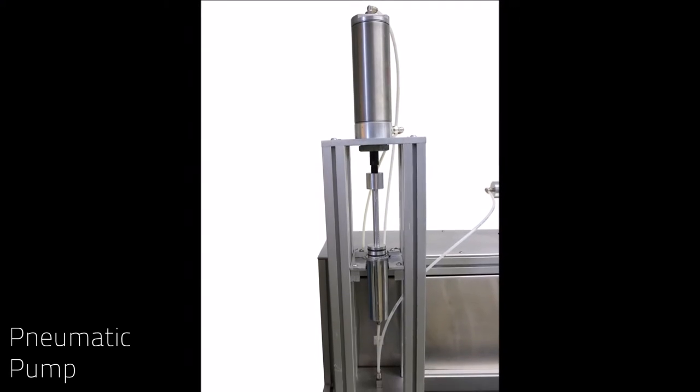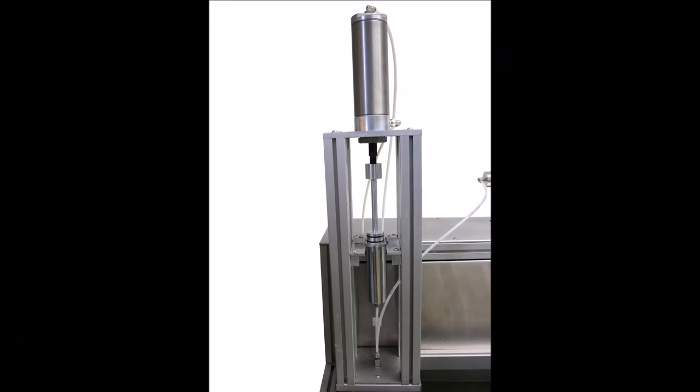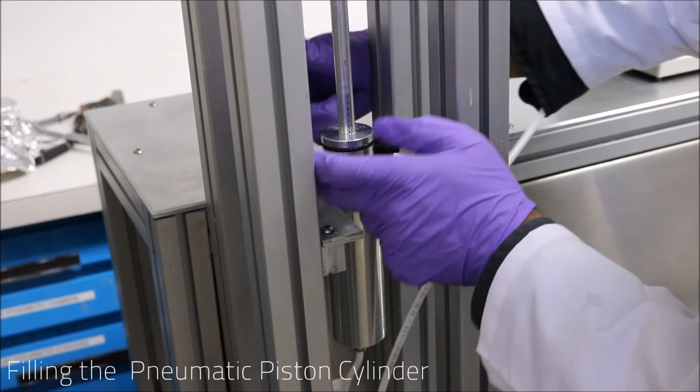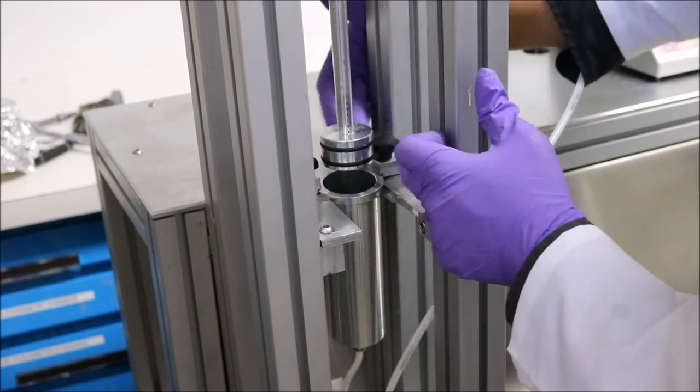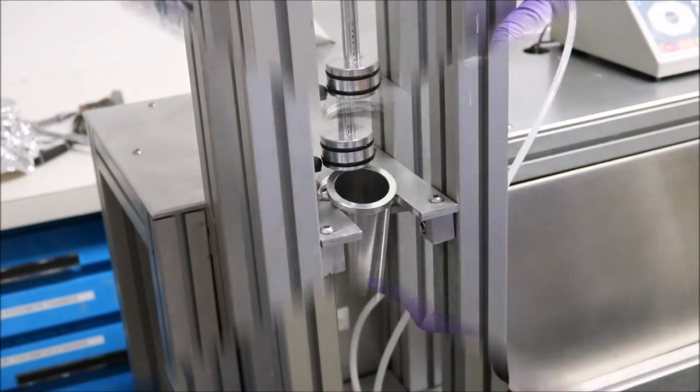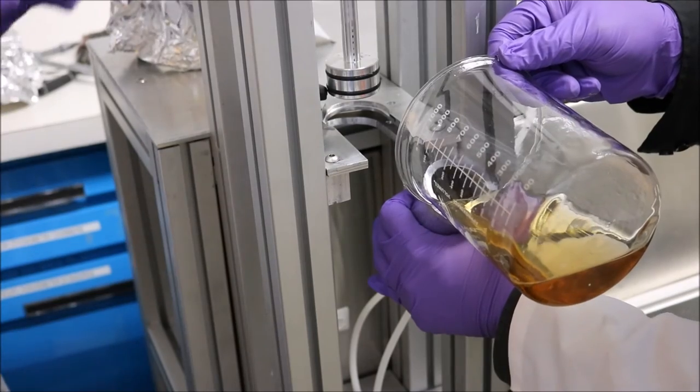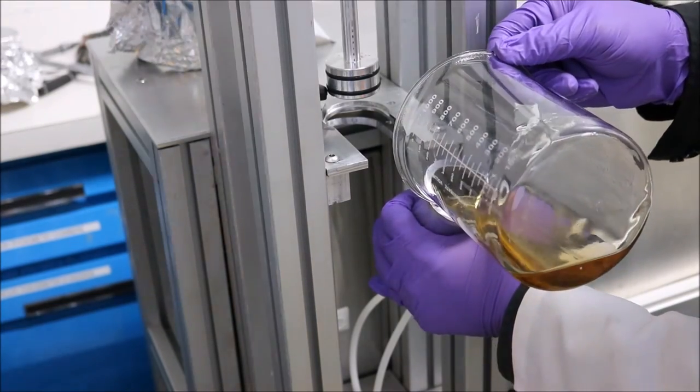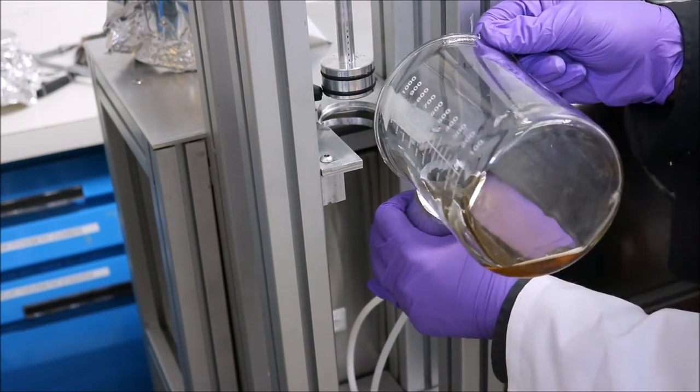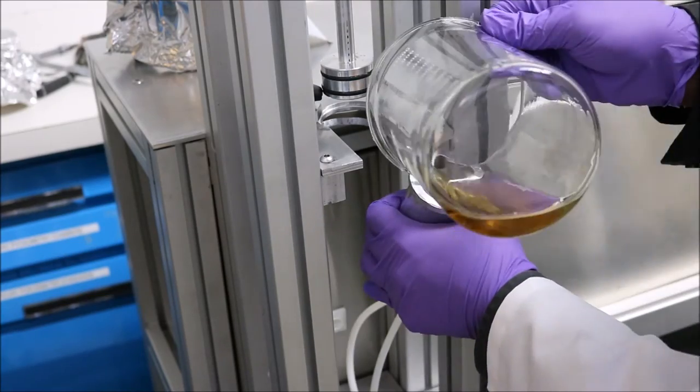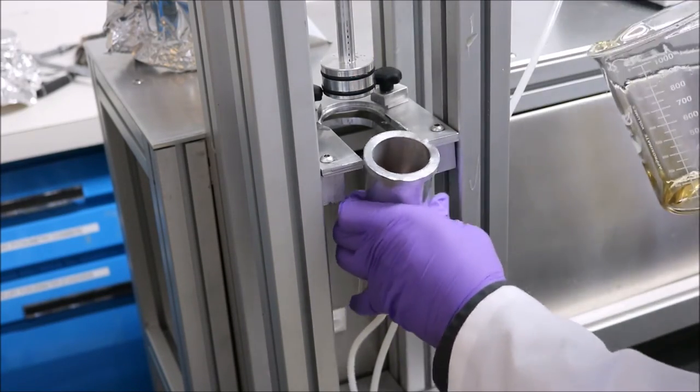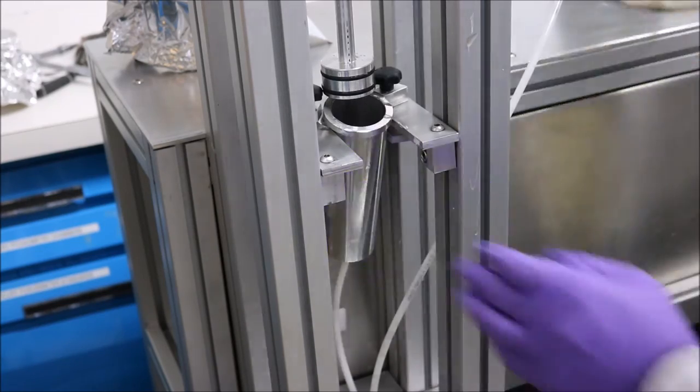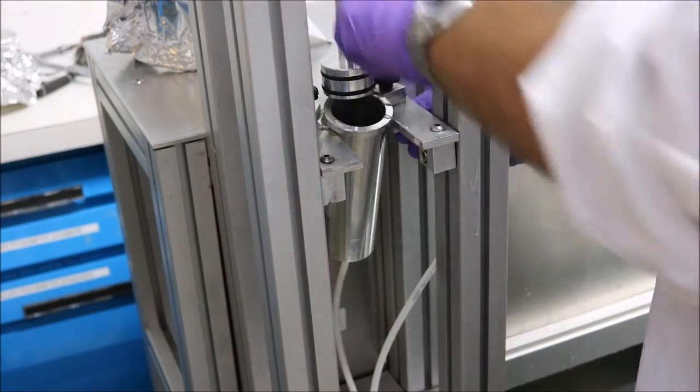The pneumatic pump holds and pumps the polymer solution at a predetermined rate. We need to first loosen the screws around the pneumatic piston cylinder that hold it in place. Next, we will fill the pneumatic piston cylinder with our polymer solution. Carefully pour your polymer solution into the pneumatic piston cylinder, then secure it back into place accordingly.